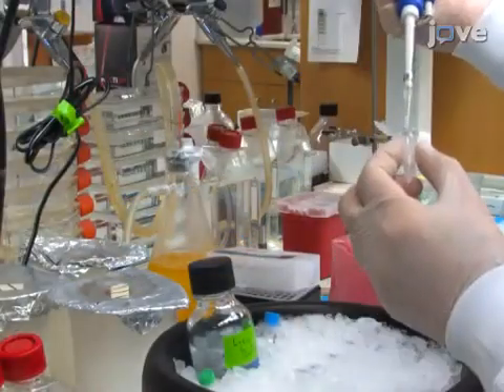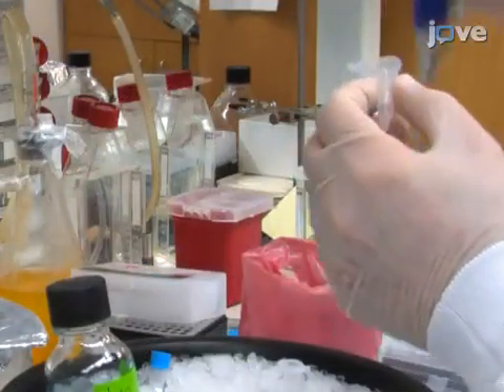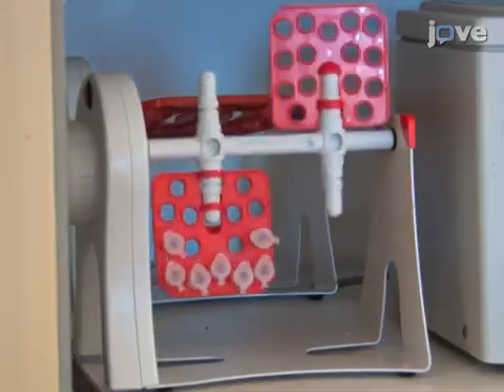Next, add 30 microliters of 50% slurry of protein A sepharose beads and lysis buffer to the lysates. Incubate the lysates at 4 degrees Celsius for 1 hour while rocking.